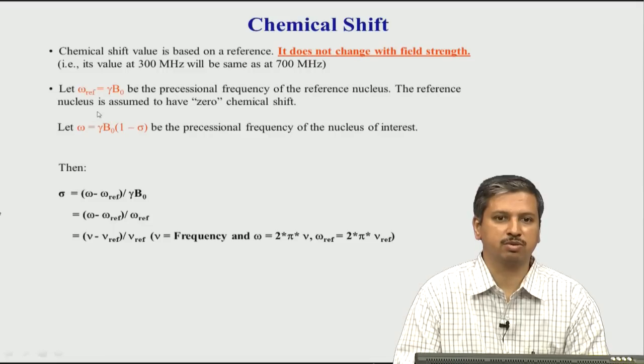If you simply subtract and rearrange to get sigma, you see that sigma can now be written like this. You just have to subtract and rearrange a little bit, and then you get this. Now look at this omega. Remember omega is given by 2 pi nu; this is the formula for omega, which is in radians per second, while nu is in hertz. When you convert hertz into radians per second, the multiplication factor is 2 pi. So, when we convert to frequency units, we get this.